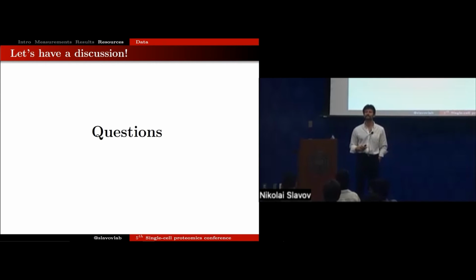Thanks, Nikolai, for a fantastic overview. Just with regard to the plexDIA, I know you've got a strong mathematics background. I wonder if you've done the theoretical calculation of how far you could push the non-isobaric labeling. Yes, we have thought very much about that because we are very seriously intending to climb that pyramid.